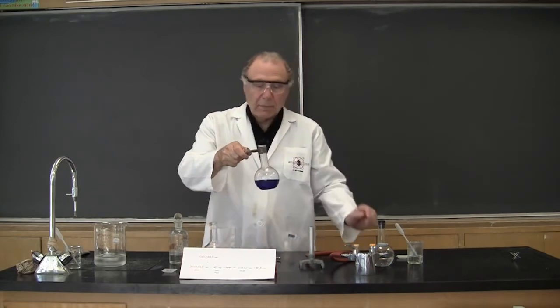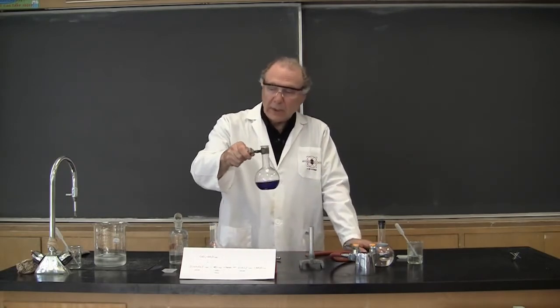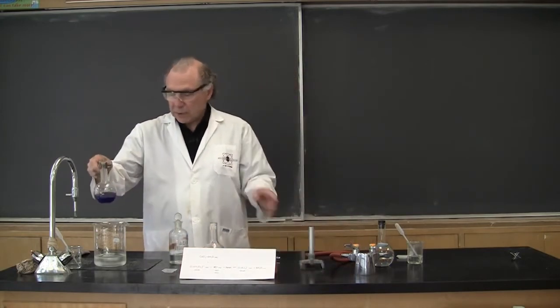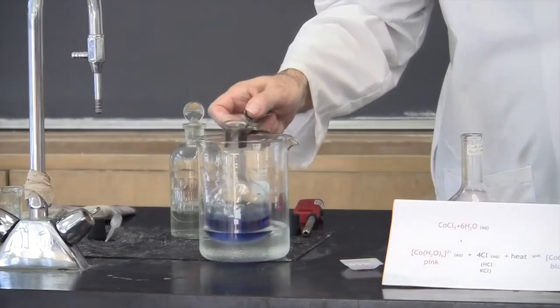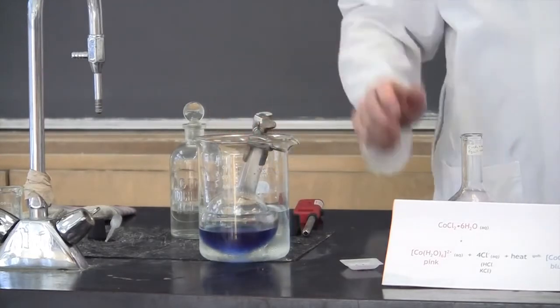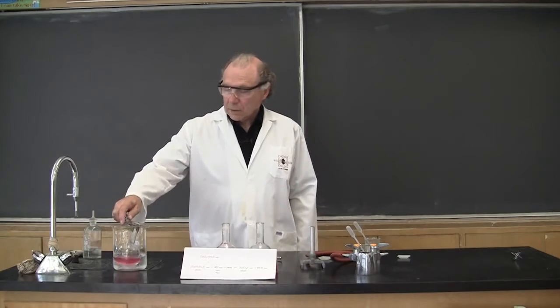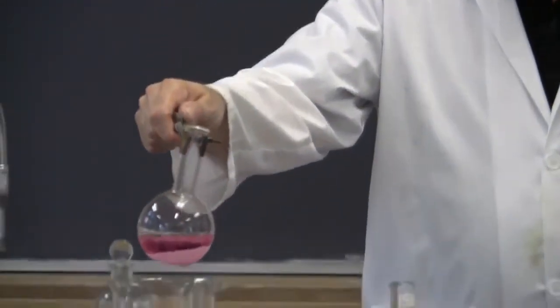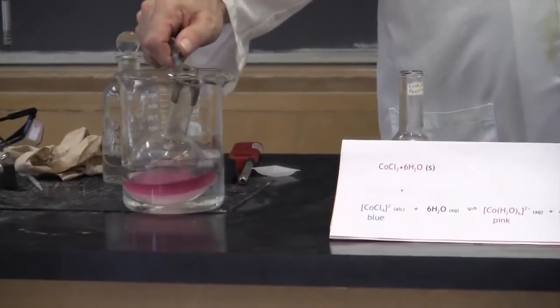Now the shift backwards is due to removing the heat, so I'll do that by putting this into some ice water just to speed things up. We can leave this sitting and then come back to it. Here after some minutes we have a nice return to the pink color.